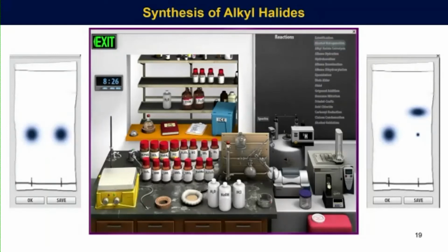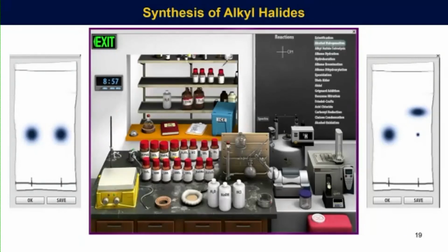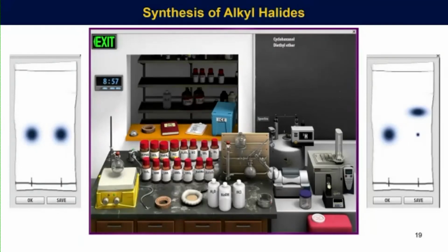So then the students play around with this and start recognizing that it isn't as straightforward as they think. It's not just click, click, click. It's click and think. So they drag this again to the front bench. They're going to add, in this case, SOCl2, which is a universal halogenating agent for organic materials. But we made mistakes. They forgot to put the needle on. SO2 is a gas, right? It blows up. So they learn the mistakes and then they fix them. They have to explain what the mistake was. And then finally, of course, if we run this with SOCl2 at room temperature with a vent, we have no problem whatsoever, and we get a nice reaction.